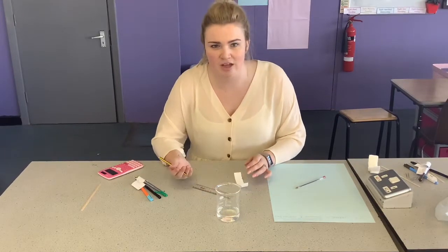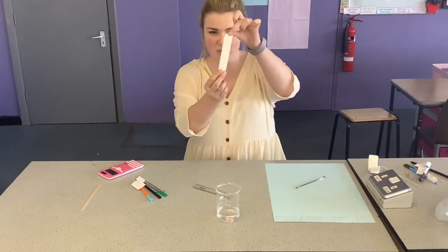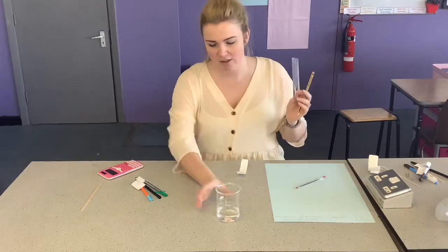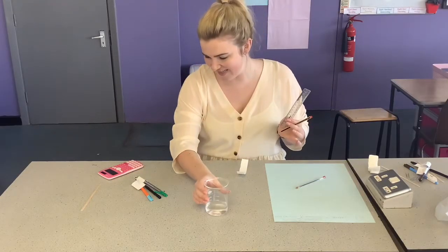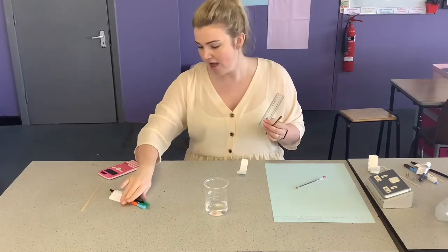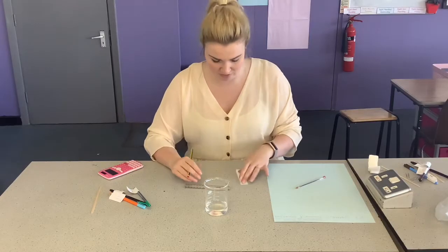I'm going to show you now how to set up paper chromatography. The first thing you need is a small piece of chromatography paper, a ruler, a pencil, a beaker filled with about 75 centimetres cubed of water, and then the pens that you want to test or the ink sample that you are testing for your chromatography.